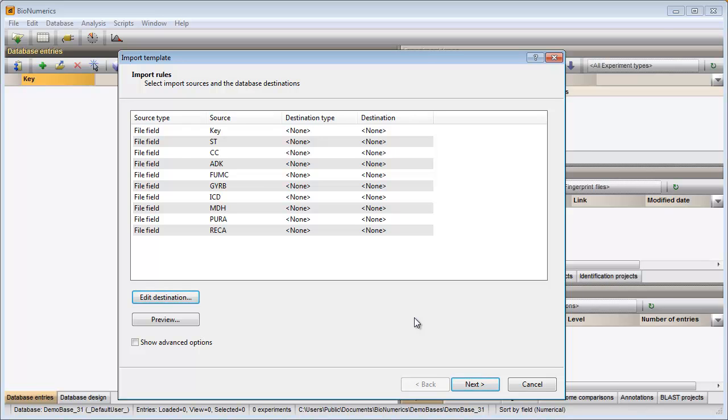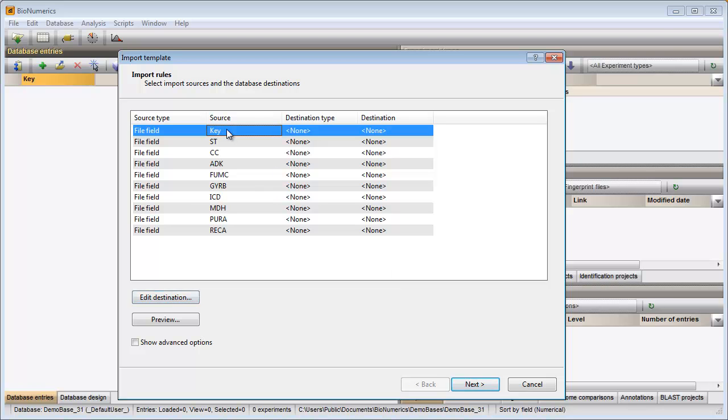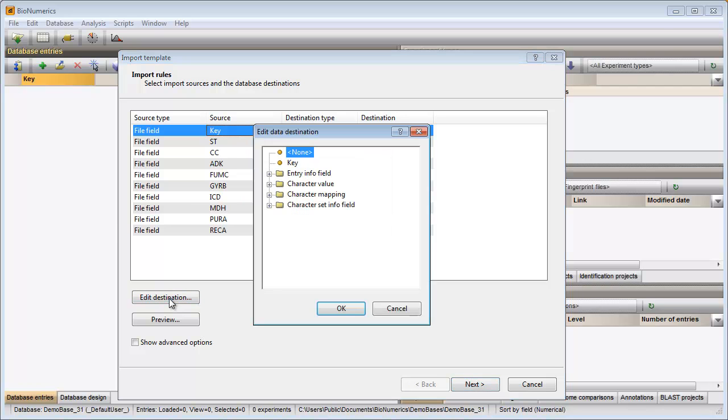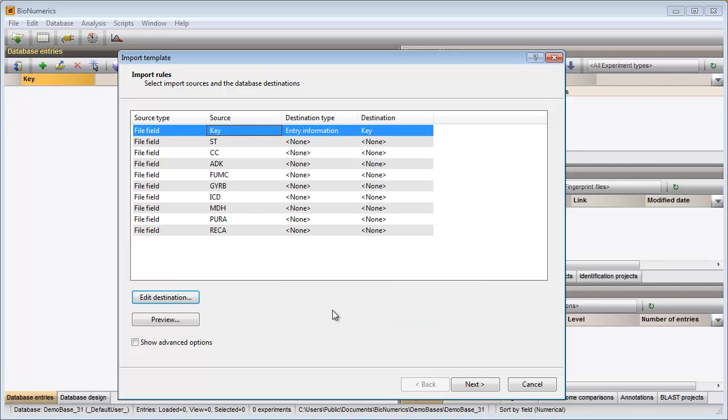The first column in my text file contains my entry IDs. To link this information to the key field, I click on the first row in the grid, press the Edit Destination button and select the key item from the list. The grid information is automatically updated.